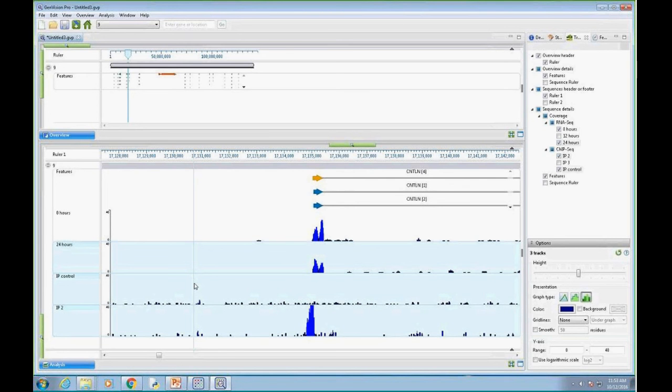Thank you. Next question is, can I combine assemblies if they were done using an older version of SeqMan engine? That's a great question. If you've got the software already and have been creating assemblies, you are able to combine assemblies done in version 13, I believe version 12 as well, but older, no. Once you get to a certain point, the .assemblies themselves do not contain some of the information that's actually needed to do the combination. But you'll be perfectly fine with version 13 and version 12.